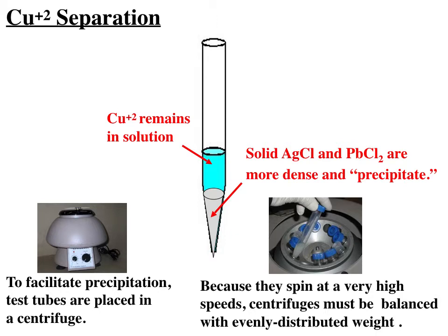So safe practice of using a centrifuge means to take a blank tube containing liquid that has no reaction in it, but has about the same mass as your experimental tube, and put it exactly in the opposite slot from your experimental tube. This balances the angular momentum of the spinning tubes, and then you will have no wobble.